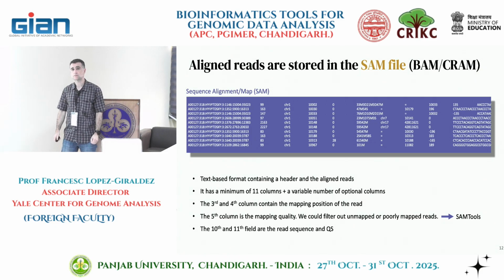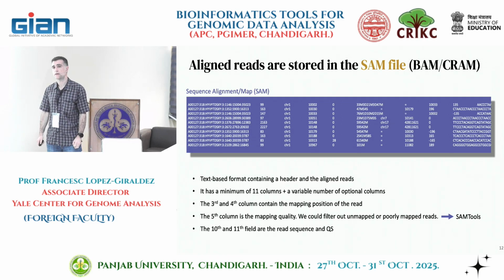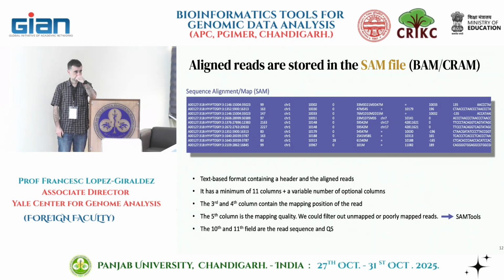I have a question actually. If you have an unsorted BAM file, the initial alignment comes without sorting. Does it follow the read order or the sorted order? I don't know. Generally we sort them by name or by position, so I'm not sure. I never tried. For a sorted BAM, I know it's based on the chromosomal position, but what happens to the raw unsorted BAM files? I don't know. Maybe it is, I'm not sure.